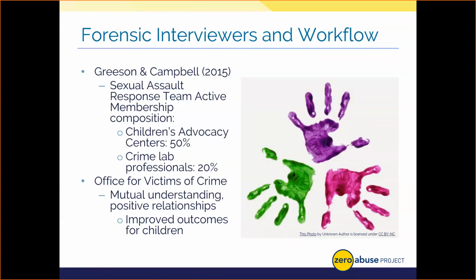We can discuss the case overall and point out key elements each other may miss in our respective career paths. And children are then ultimately kept safe because we streamline our process based on each agency's known duties and responsibilities. My goal then today is to walk you through how a lab is set up to protect your evidence from my point of view as a biologist, given that DNA is one of the most prevalent items submitted for analysis. By understanding the workflow of your items and how a biology unit laboratory is set up to ensure high quality and low contamination results, I hope that you better recognize all that your analysts go through to get you key evidence with the best results possible to help those that you serve.